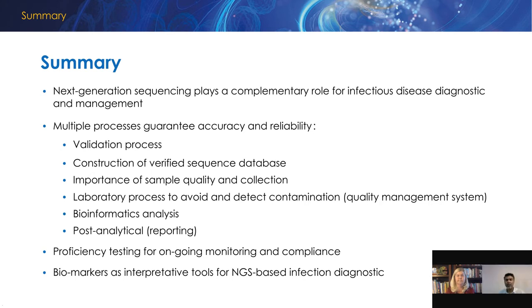The other portion is if you can use live organisms, or they could be inactivated organisms, but ideally organisms that have an entire structure that hasn't been compromised. That way we can better evaluate the extraction protocol. That would be the ideal scenario.